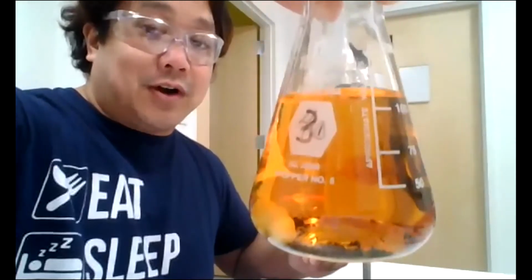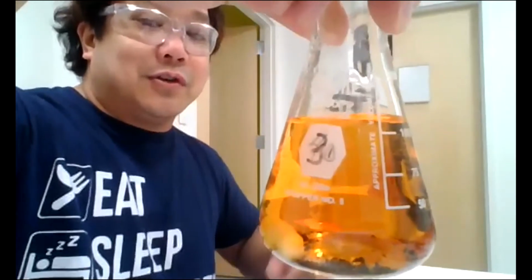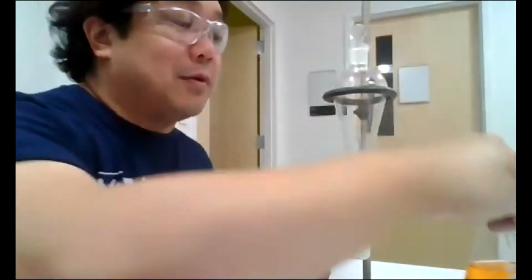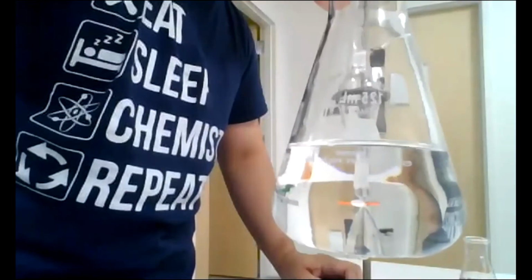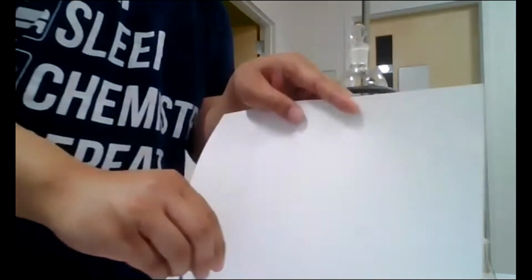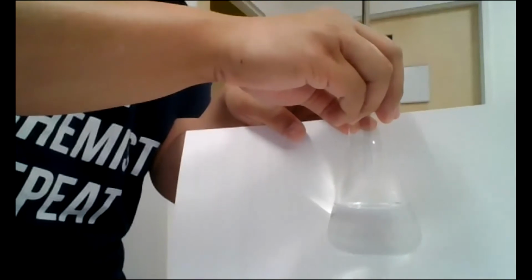See, this is your observation. So you're starting iodine solution, you've got to describe this, okay? You've got to describe this. I am looking for your observations. Cyclohexane looks like this. Cyclohexane looks like that. Right? Maybe it might be helpful if I had possibly a piece of white paper. So this is another technique. You view your solutions behind a white piece of paper.